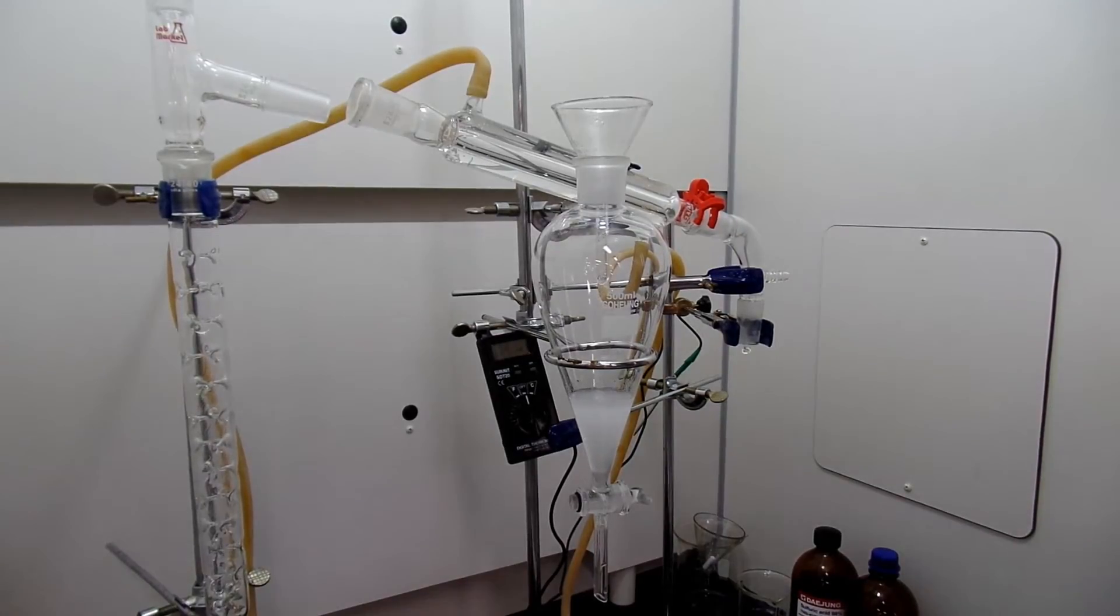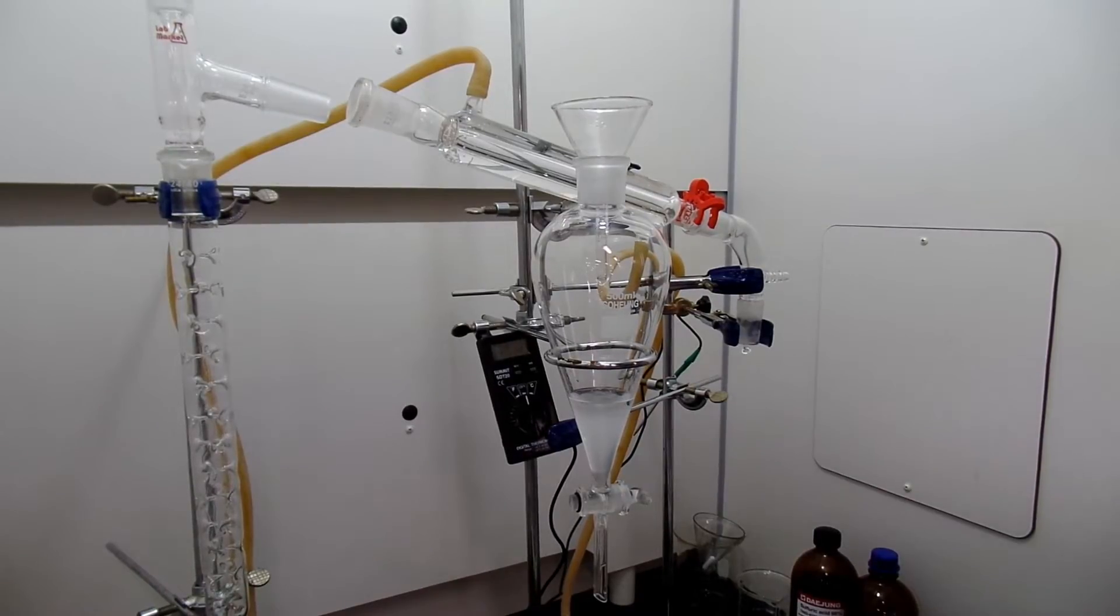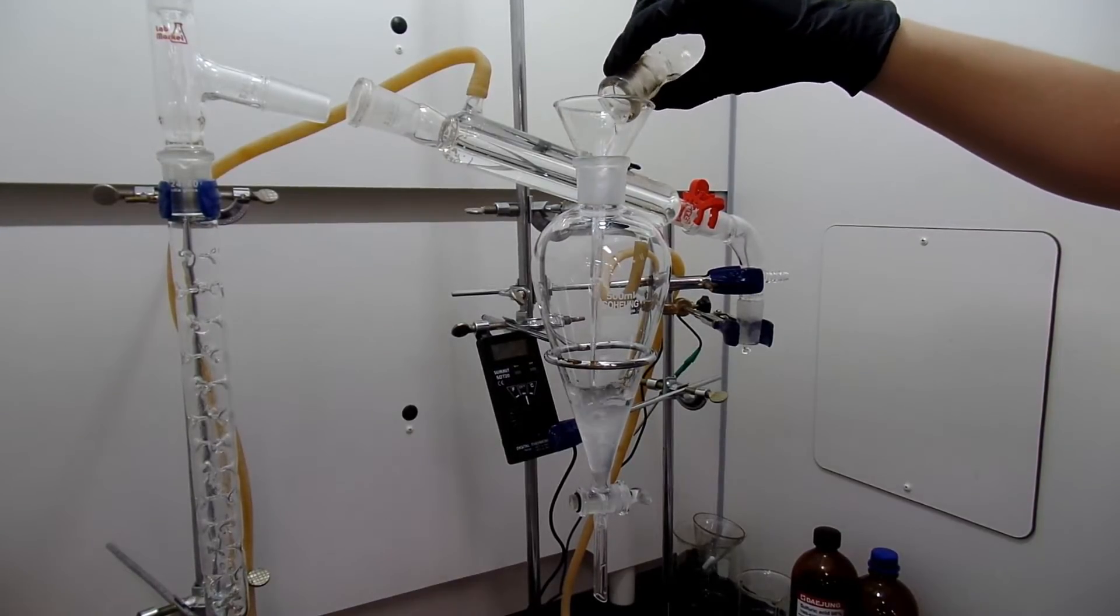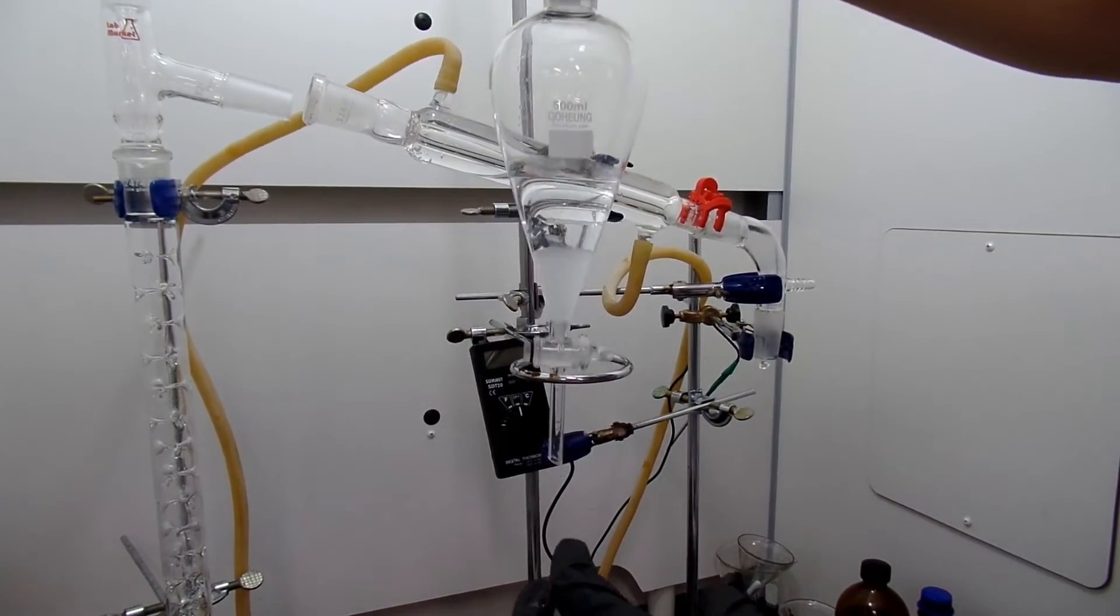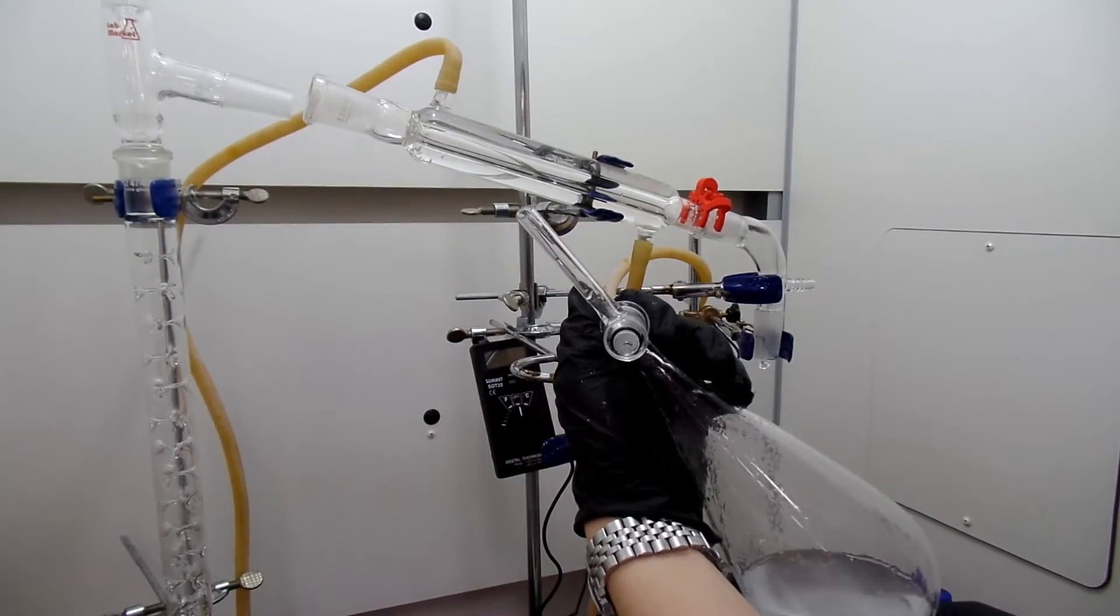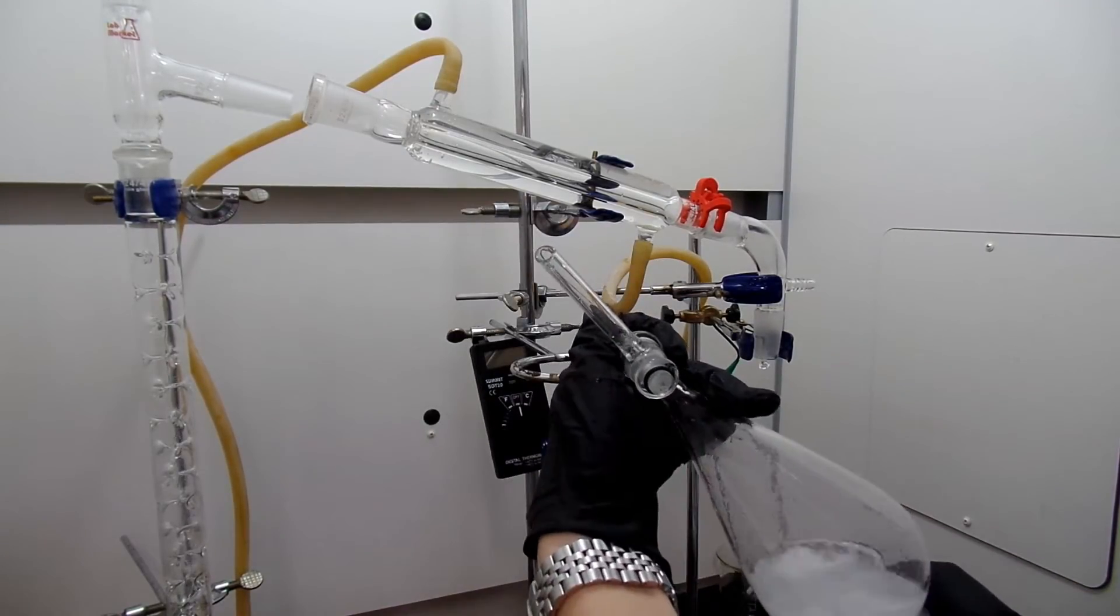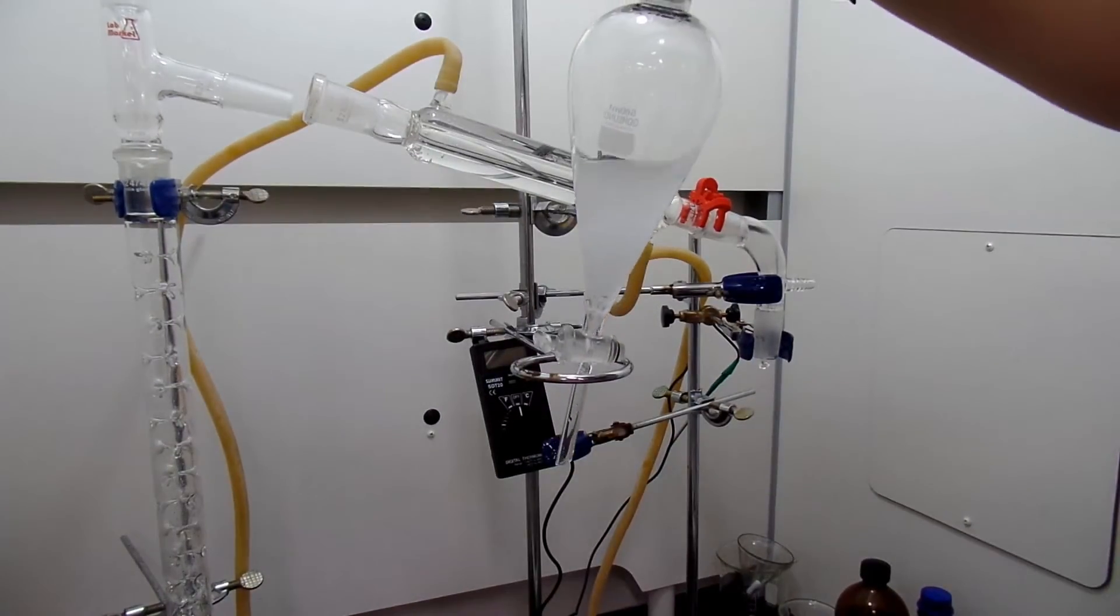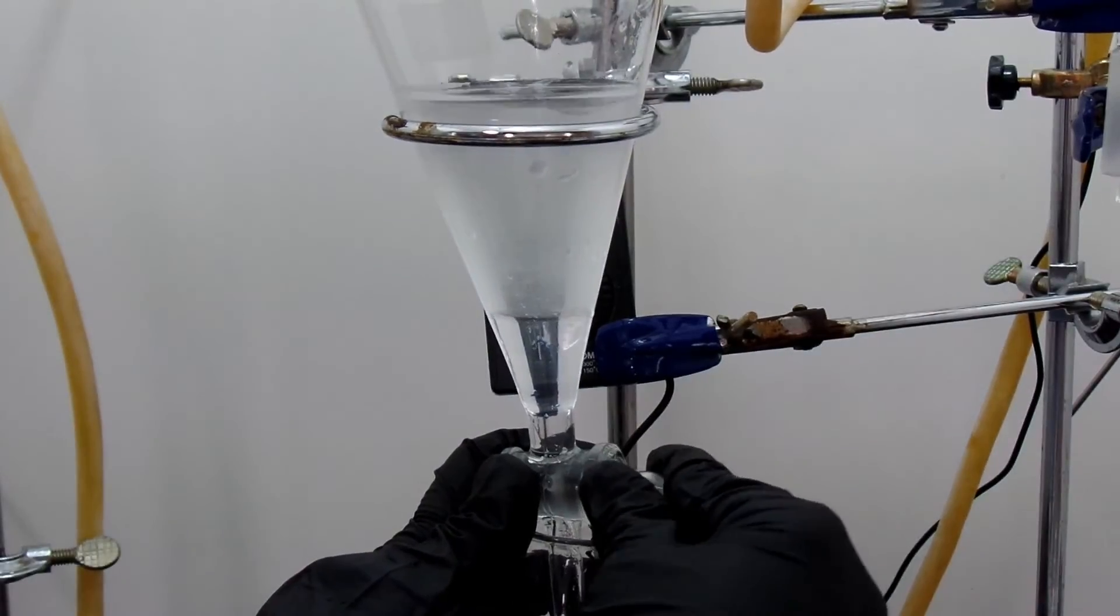For the separation, add everything to separatory funnel and wash the flask with some water. 100 ml of water is added and shaken. You need to vent this thing frequently. The lower layer is obtained.